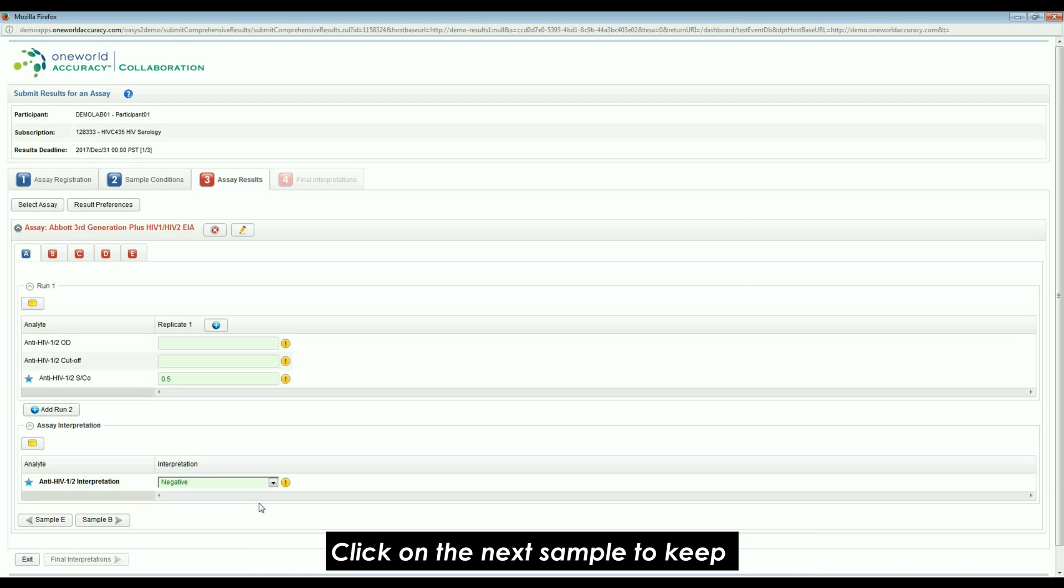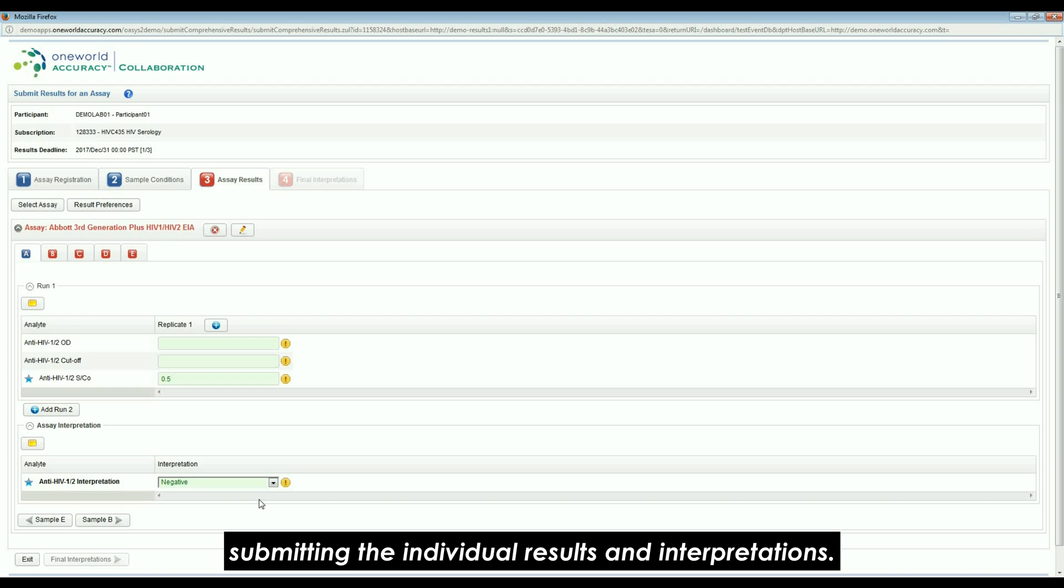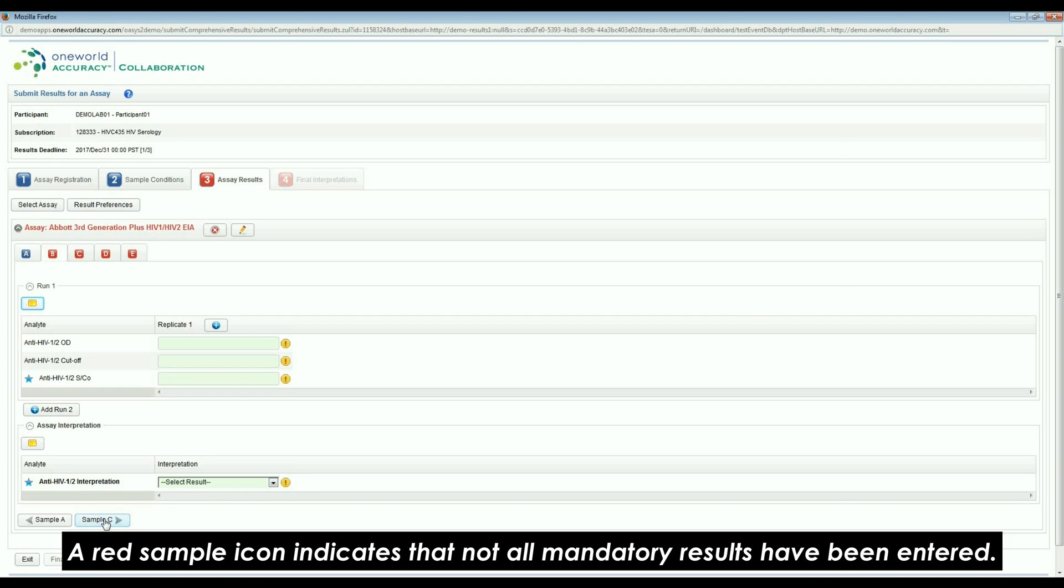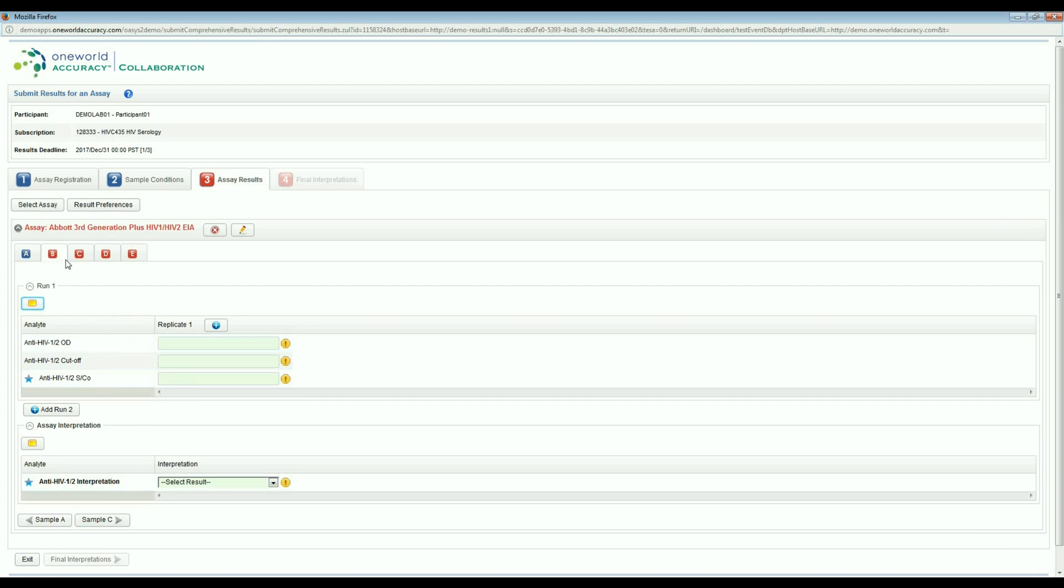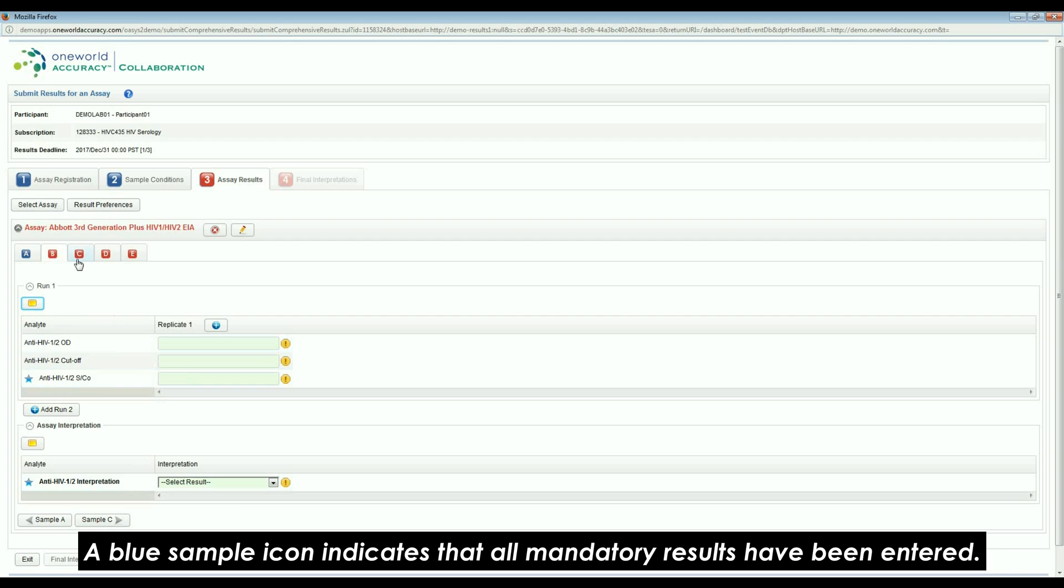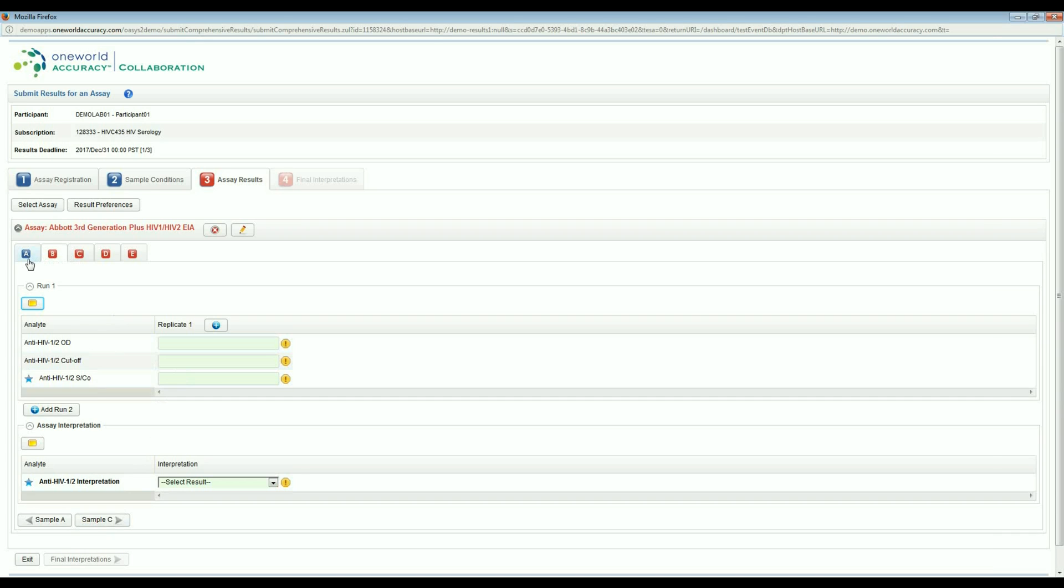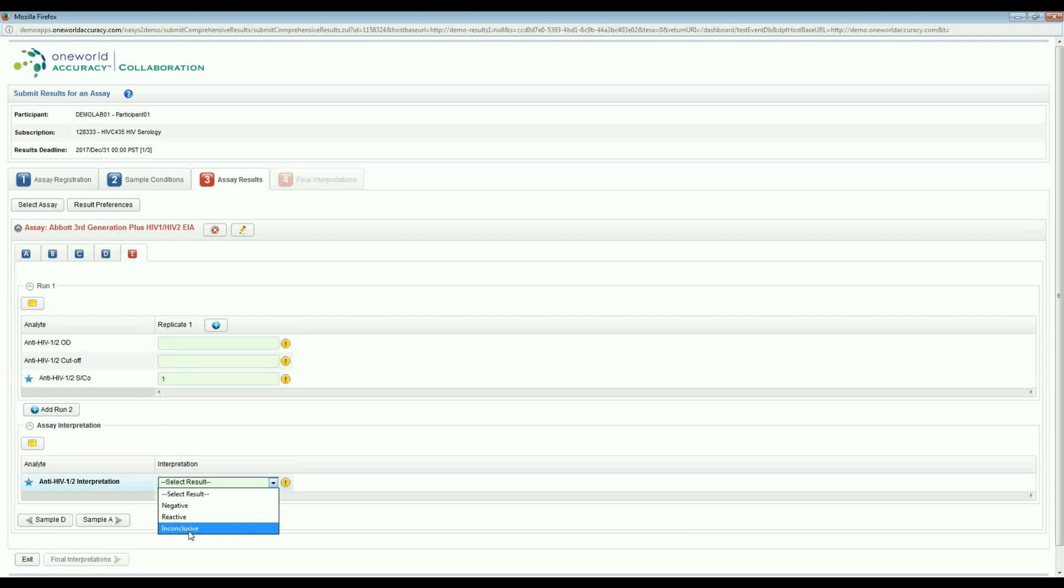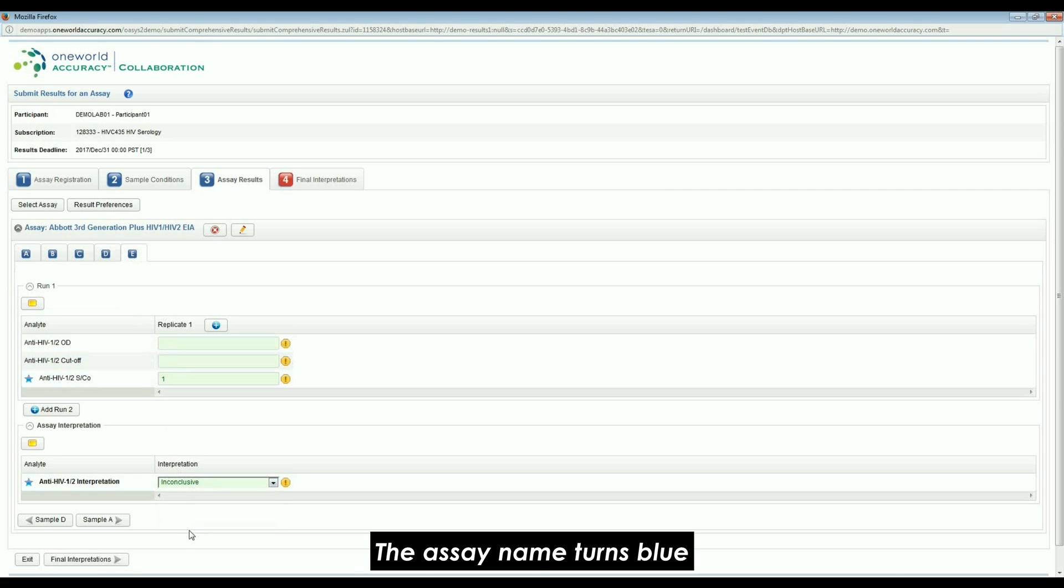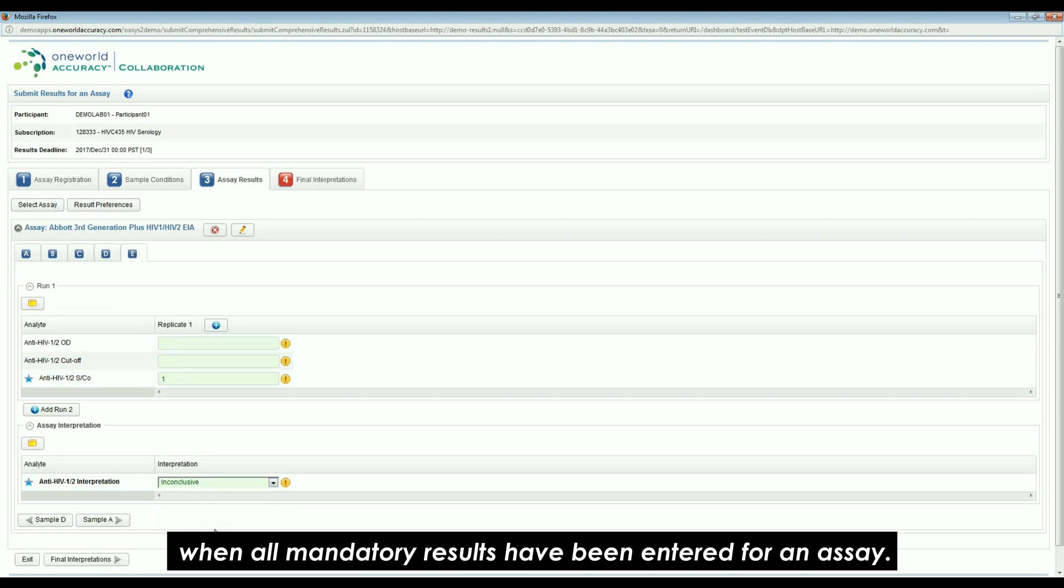Click on the next sample to keep submitting the individual results and interpretations. A red sample icon indicates that not all mandatory results have been entered. A blue sample icon indicates that all mandatory results have been entered.